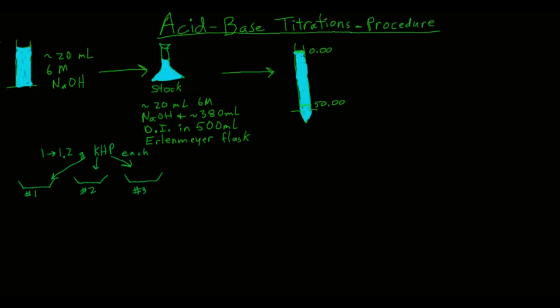Then fill the burette as before, making sure after you fill it that you get all the air out of the tip. Make sure the volume of the sodium hydroxide stock solution is below the zero mark — remember, 0.00 is at the top, 50.00 is at the bottom. Never go past the 50 mark, and read the volume to two decimal places. The burette will be in a burette clamp on a ring stand.